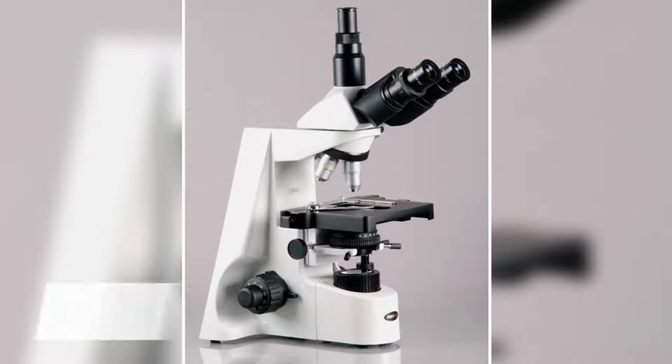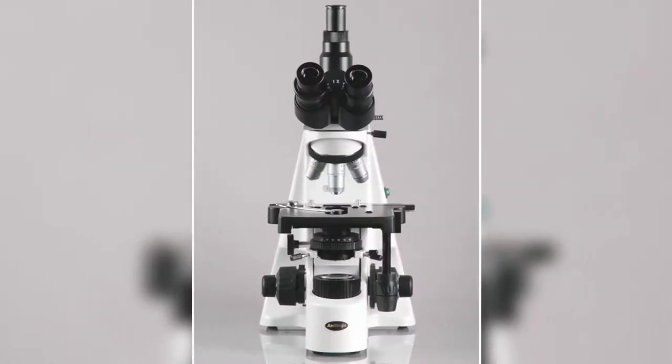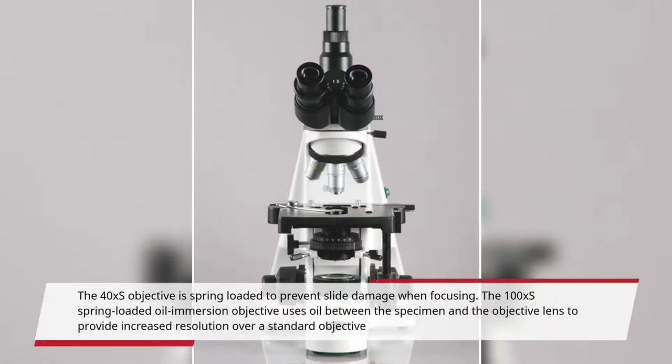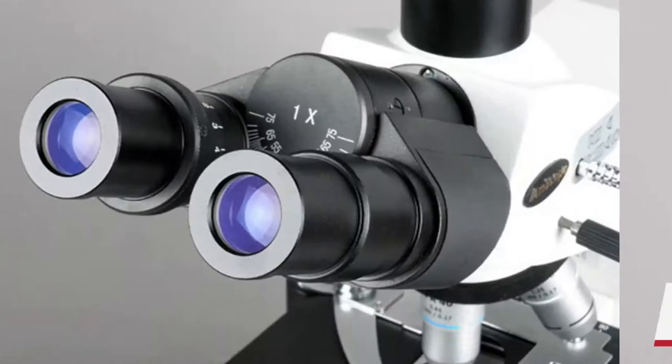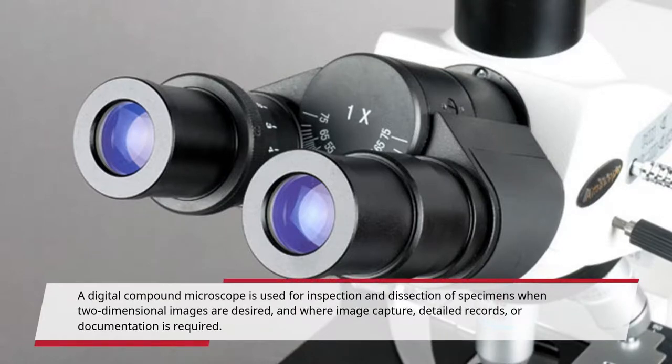The reverse-mounted revolving nosepiece has 4x, 10x, 40xs, and 100xs oil DIN Infinity Objectives that provide a longer working distance for improved focus when auxiliary components are utilized. The 40xs objective is spring-loaded to prevent slide damage when focusing. The 100xs spring-loaded oil immersion objective uses oil between the specimen and the objective lens to provide increased resolution over a standard objective. A digital compound microscope is used for inspection and dissection of specimens when two-dimensional images are desired, and where image capture, detailed records, or documentation is required.